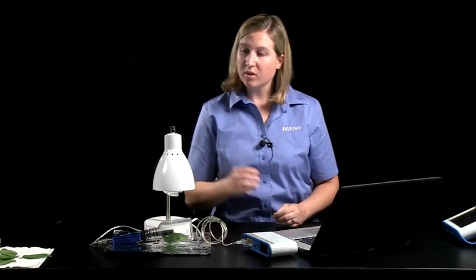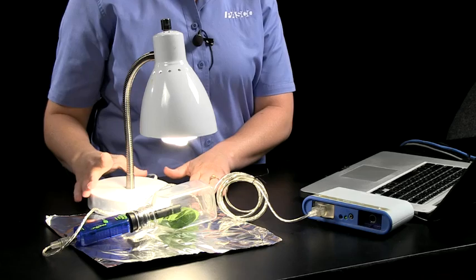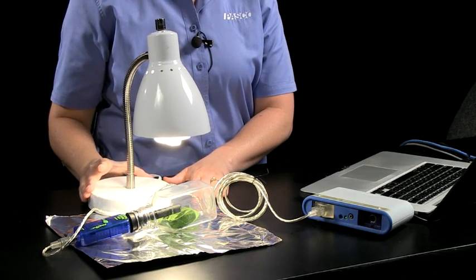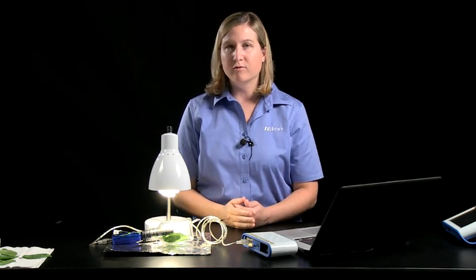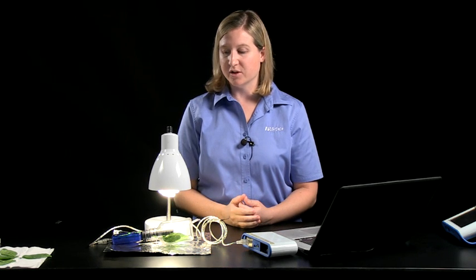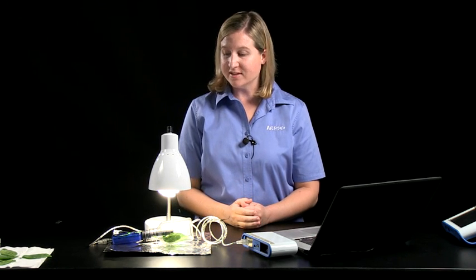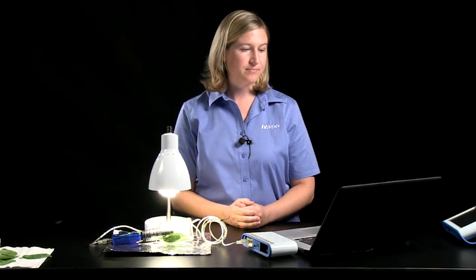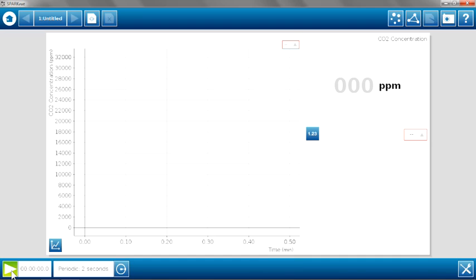So I'm now ready to begin data collection. I'm going to turn on the light, and I'm going to let the light shine directly on the bottle with the spinach leaves inside for about 30 seconds or so. The carbon dioxide sensor can be affected by light, and this will allow us to have a stable reading inside that bottle before beginning to collect data. When we're ready to collect data, we're just going to hit the play button to begin data collection.